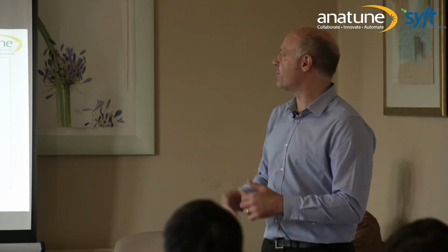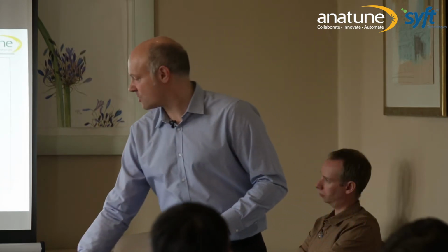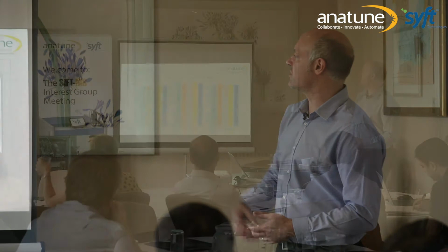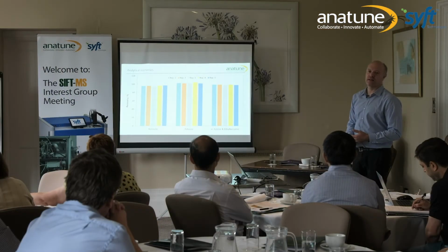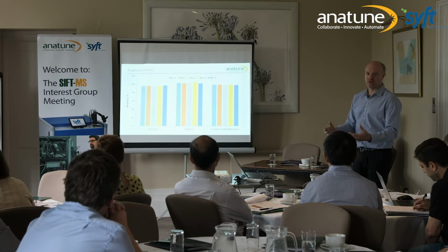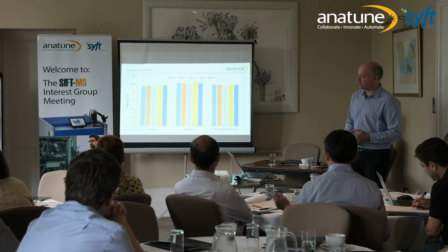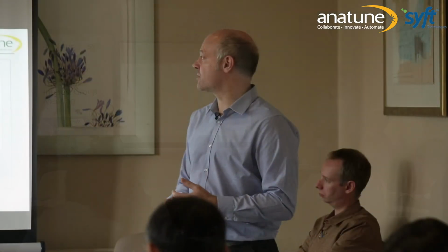And you see we get RSDs of about 1% or less for each of the analytes. So again, a highly precise method. And just to show that we're recovering the right concentrations, these are the recoveries for that data. So again, we're recovering near to 100% of what we expect to see. So it is precise, and the methodology works for us. The method works and the instrument allows you to make those measurements as well.